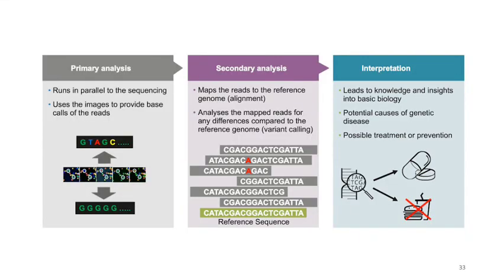Following the demultiplexing step, the data is filtered to get rid of files with poor Q-scores. Remember, you are sequencing hundreds of pieces of DNA at the same time. The sequence is then compared to a reference sequence such as the human chromosome available on the NCBI website. An alignment is made and sequence variants can be identified. The next step in the process is to determine whether these variants are clinically significant or not. Dr. Hume will show you how this is done in another lecture.